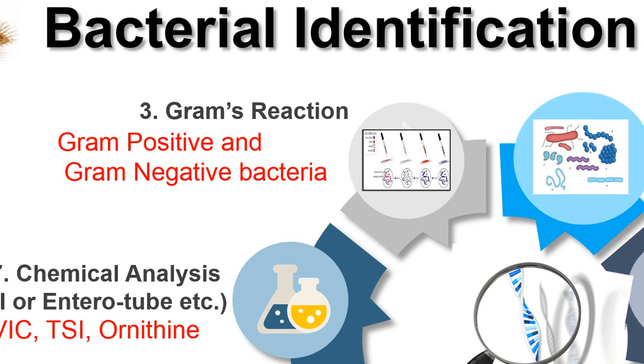This classification of bacteria, the division into these two wide groups, is still in use, and we are very much obliged to Hans Christian Gram for helping us start this basic differentiation from the first point of Gram's reaction. Now, what happens in this Gram's reaction?